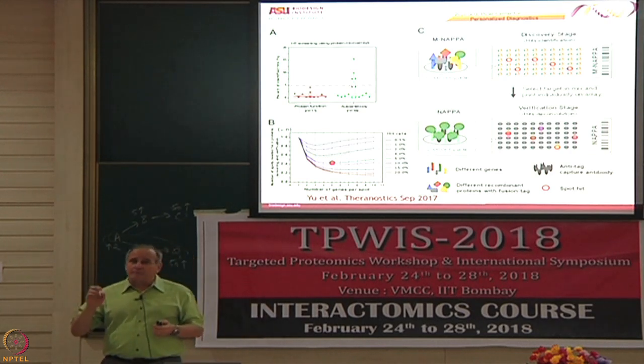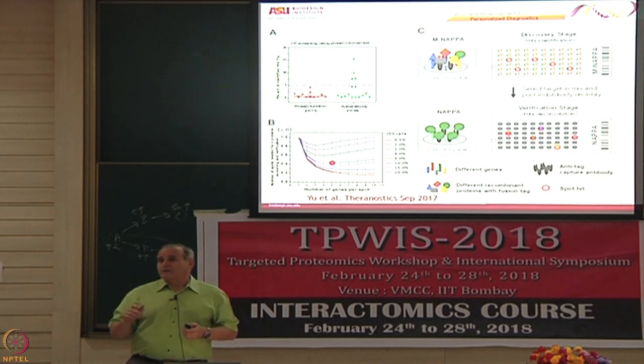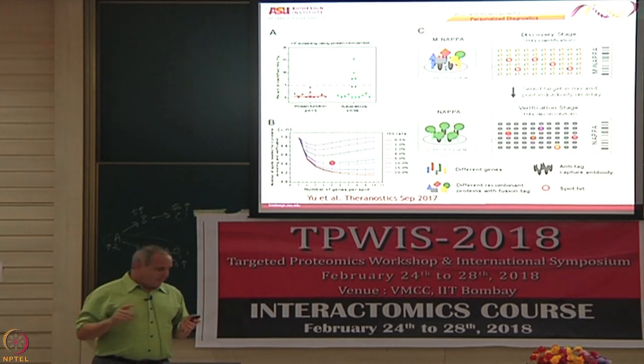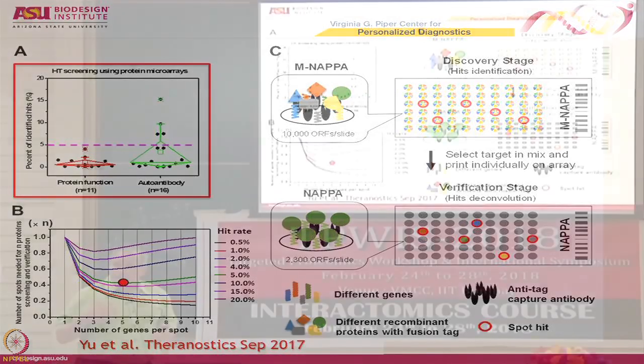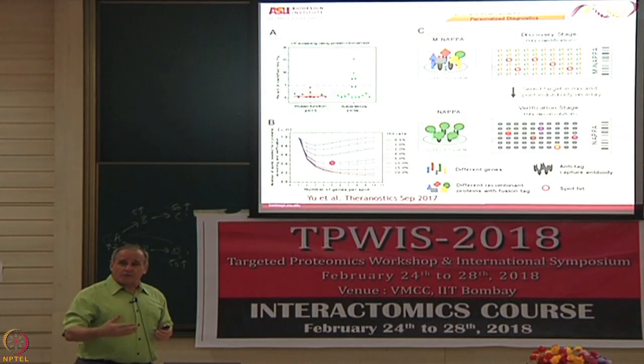Okay, so then the question was, what's the optimum number of spots we can do, maybe making the assumption that the hit rate is 5%, even though I think that's probably a little high for most of them. I think it's a fair assumption. It's a more conservative estimate. If we can satisfy that one, we're certainly going to take care of everything that's lower than that.